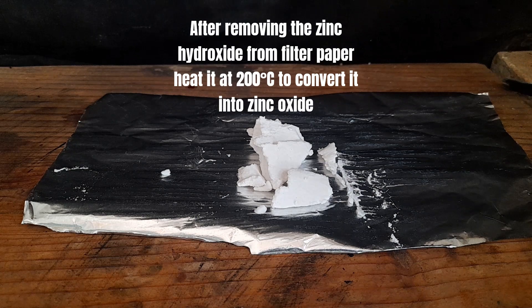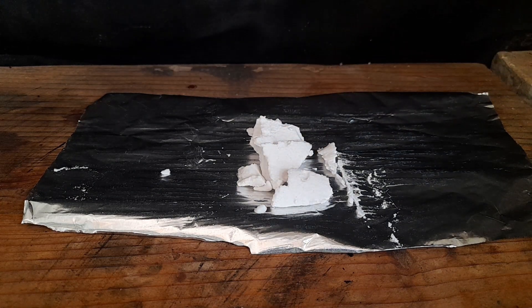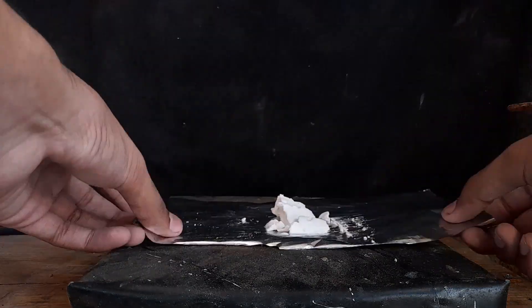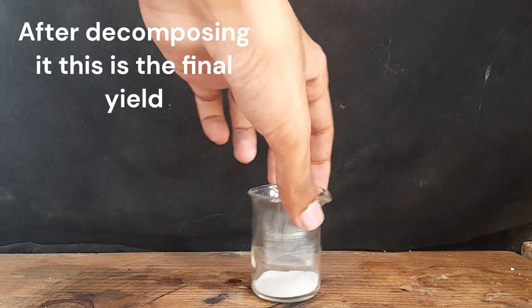After removing the zinc hydroxide from the filter paper, heat it at 200 degrees Celsius to convert it into zinc oxide. Zinc hydroxide decomposes at 200°C into zinc oxide and water. After decomposing, this is the final yield.